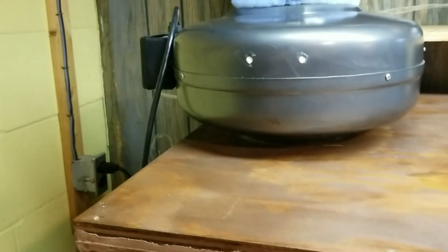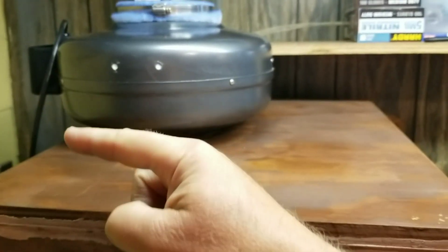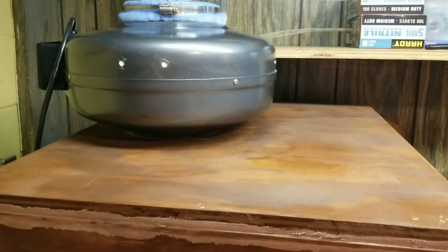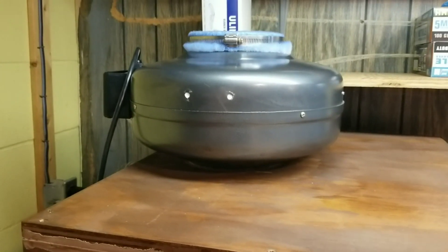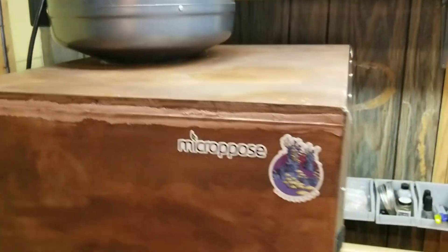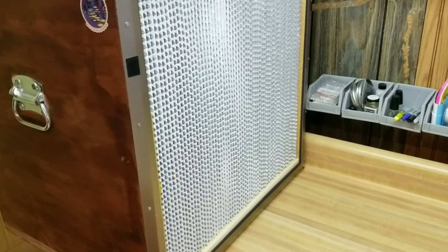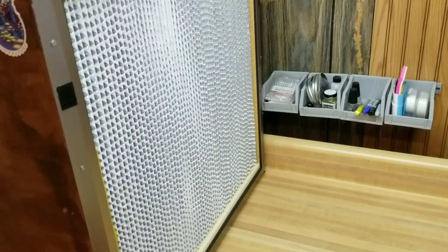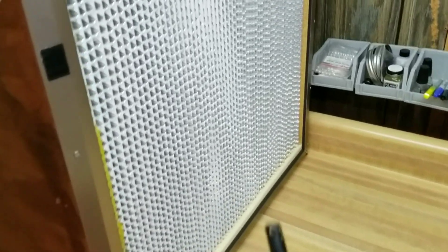The fan is mounted towards the back of the box because you don't want it blowing right down onto your filter. The idea is you want the fan to just pressurize the box. So the fan pressurizes the box, everything's sealed up, and it just forces a nice even flow. You can buy fancy airflow meters online to test your flow in front of your flow hood and figure out exactly how much flow you're getting across your table.